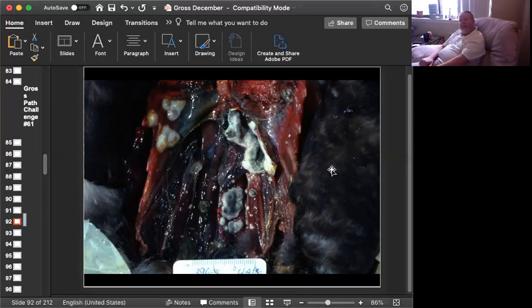Morphologic diagnosis and cause. I think that's fair. Okay, time's up. And this is a condition that is seen very commonly in animals that, like eider ducks or penguins, are normally in a very cold environment, and you put them in a zoo, which if not stressful enough, then they're in conditions that are hot.